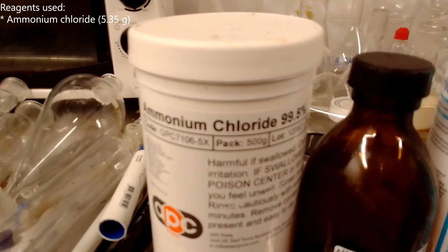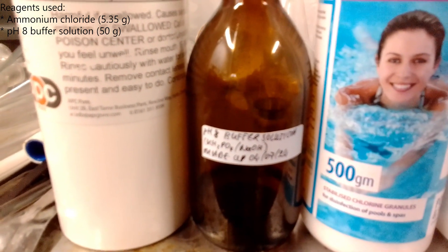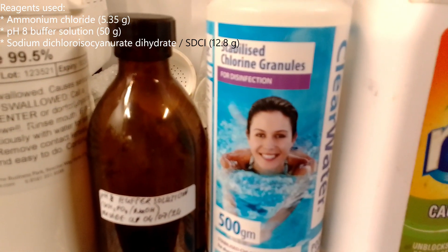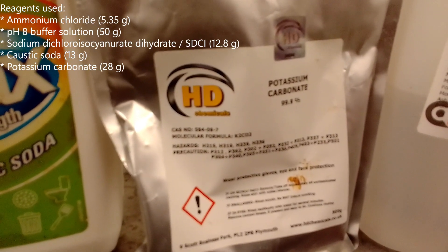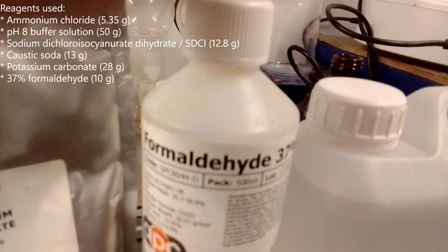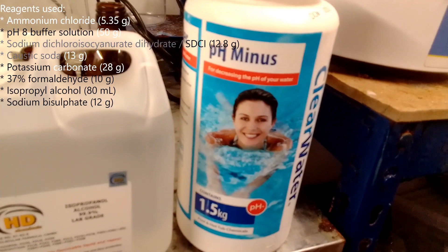Reagents used were: ammonium chloride, 5.35 grams; a pH 8 buffer solution, 50 grams; sodium dichloroisocyanurate dihydrate, 12.8 grams; caustic soda, 13 grams; potassium carbonate, 28 grams; 37% formalin, 10 grams; 80 ml of isopropyl alcohol; and sodium bisulfate, 12 grams.